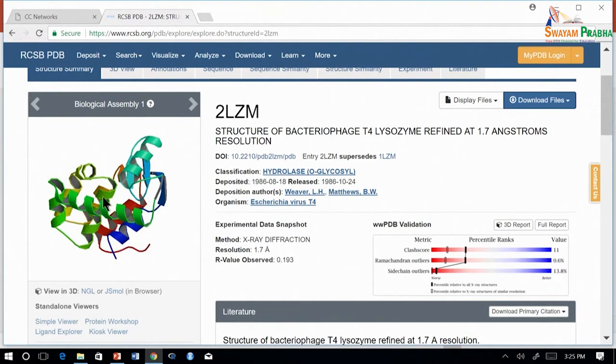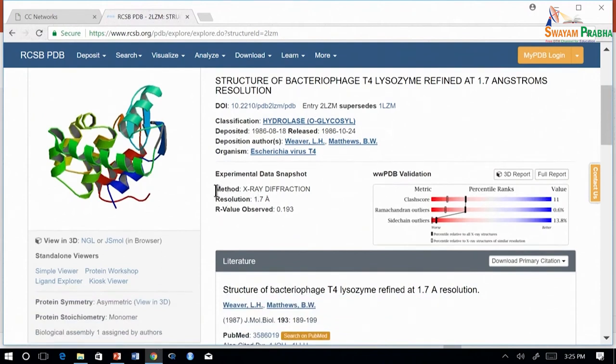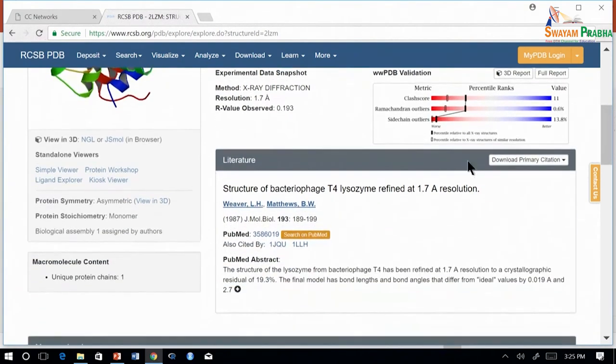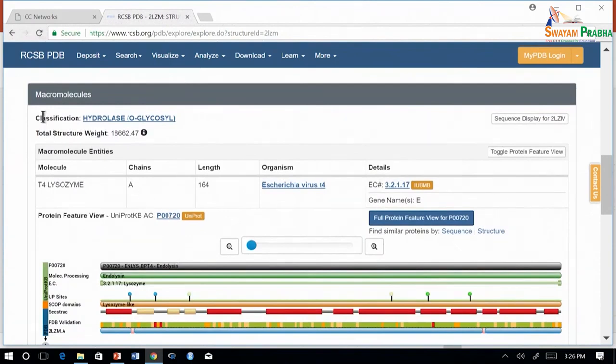For example, this structure is classified as a hydrolase. The experimental method which was used to get this structure is x-ray diffraction and the resolution is 1.7 angstroms. PDB also provides a literature reference from which the structure was taken. Further you can find the macromolecules in the structure. In this structure we have only one entity, that is the T4 lysozyme. This is identified as chain A and it has 164 residues.